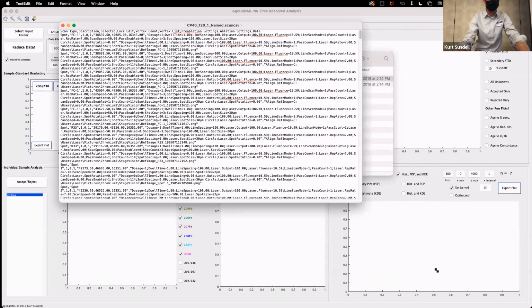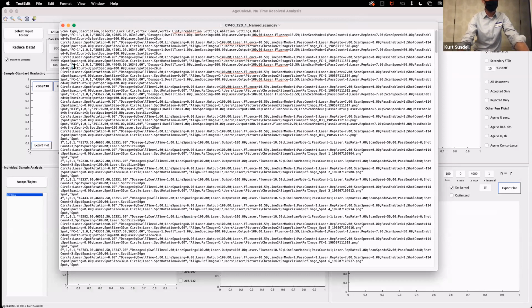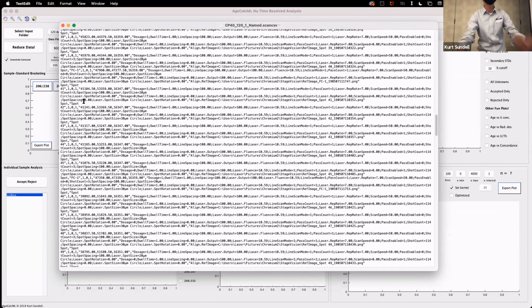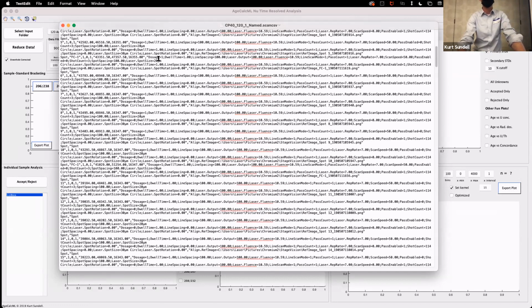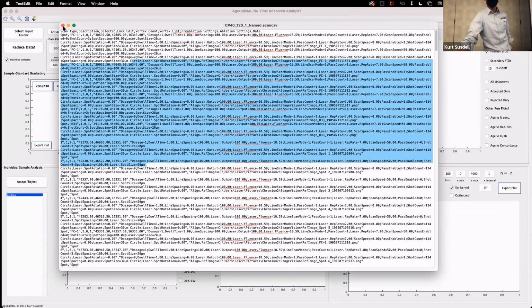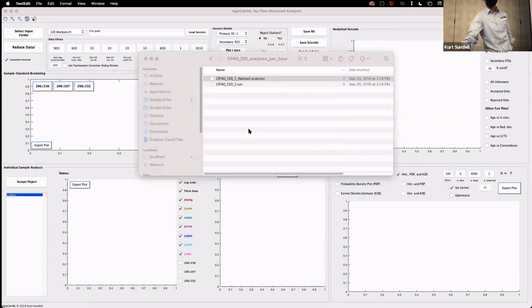The scan CSV, Dan showed some of this. This is a text version of what Dan showed. It's just sample after sample after sample, and it just goes on and on. This just tells the laser where to go, drive around, how long to shoot, how big of a laser beam to shoot the zircon. That's all this scan list does. So when you go picking your spots, this monster text file is what you're actually programming. So the data reduction needs that.